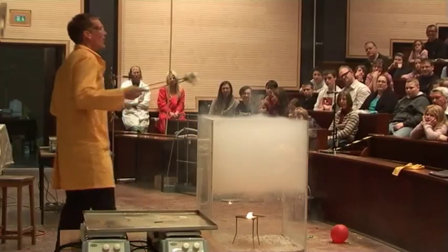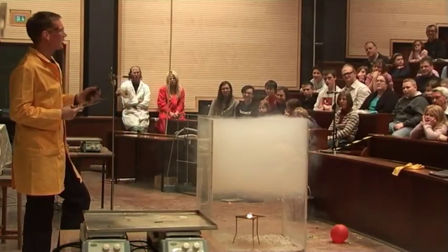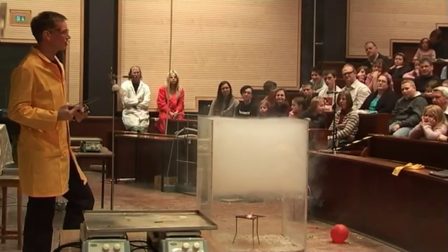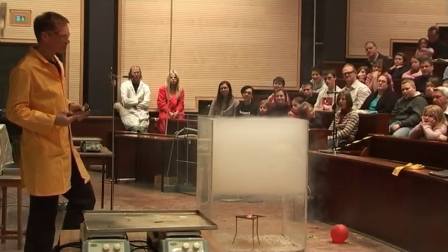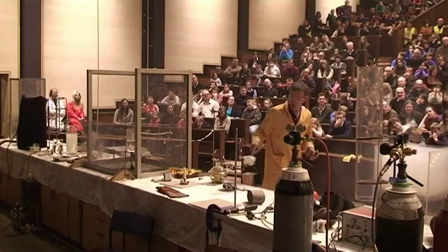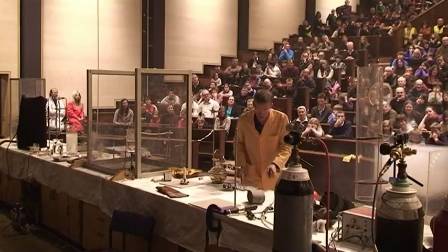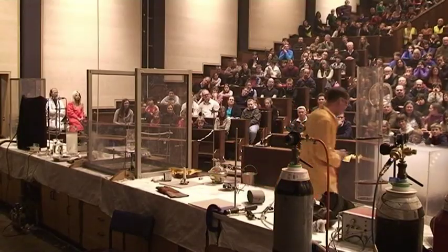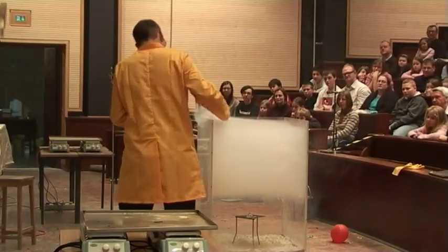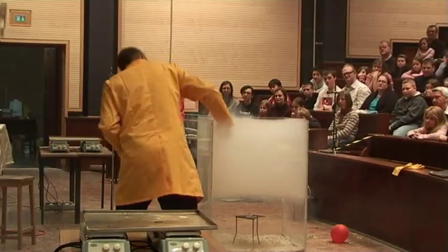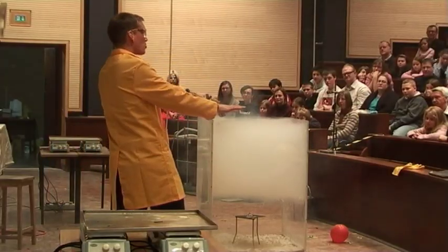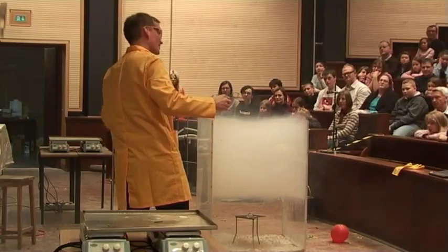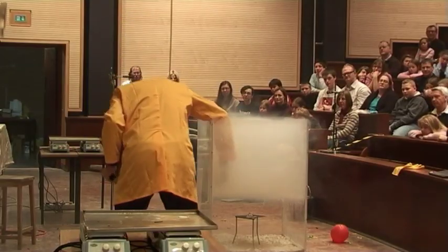So carbon dioxide is very good for putting out fires that form carbon dioxide or water, but it's no good at putting out the magnesium. Well, what's happening here? If I reach in and take this out, you see a lot of smoke forming on the surface here. This is magnesium oxide.